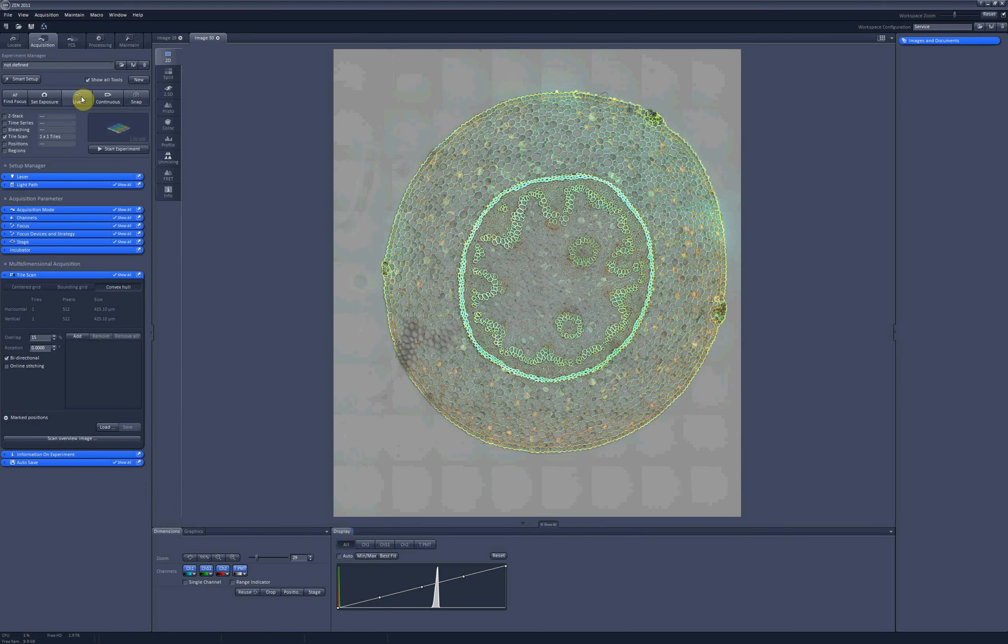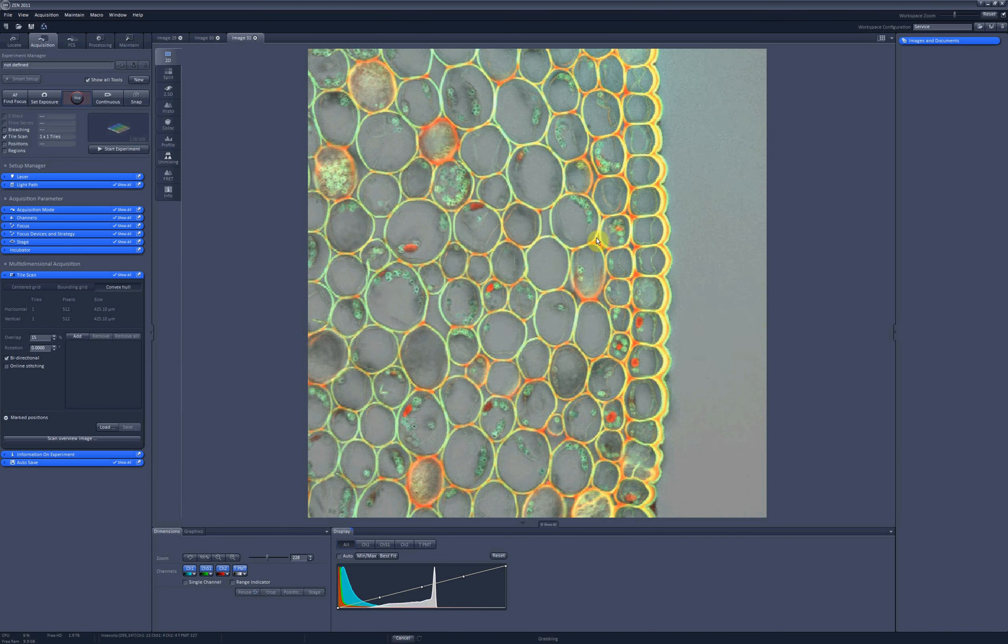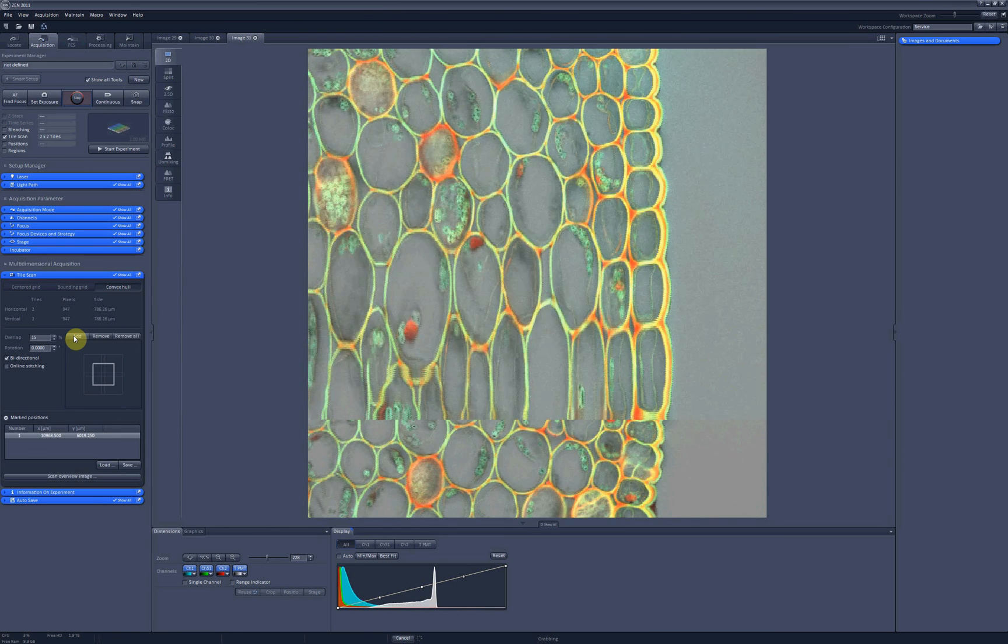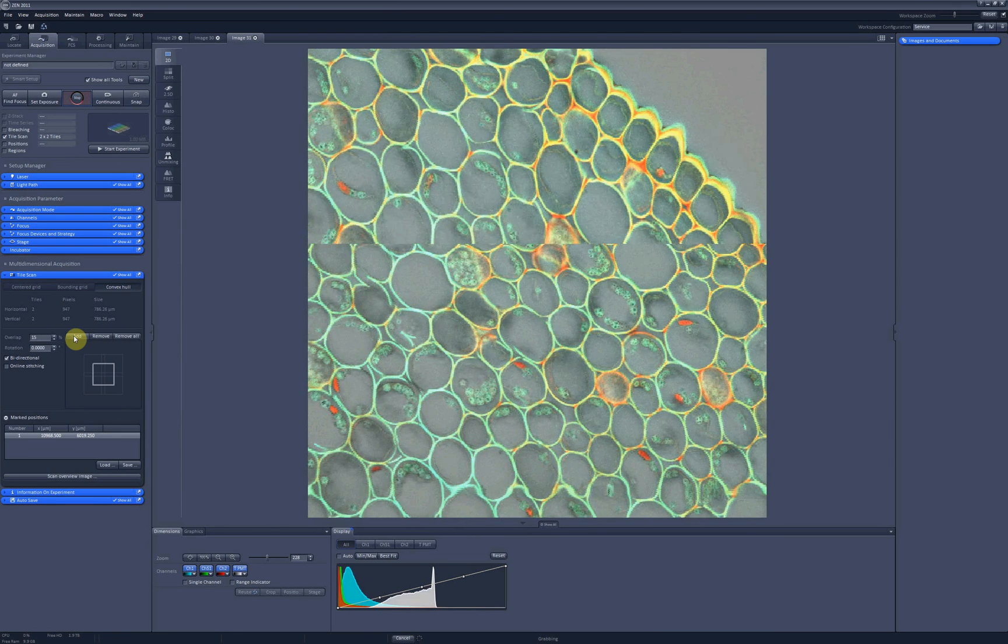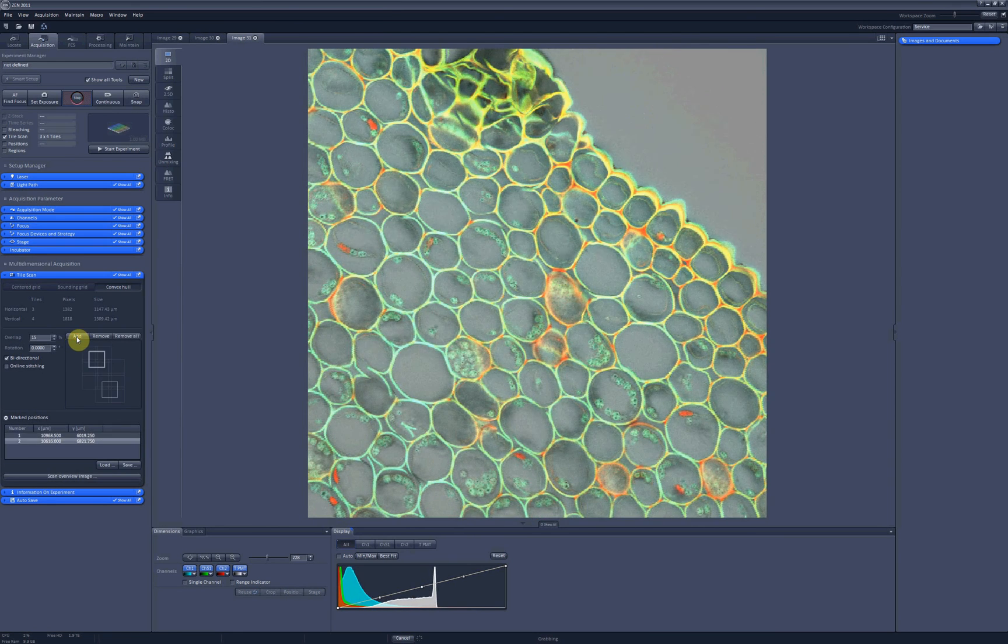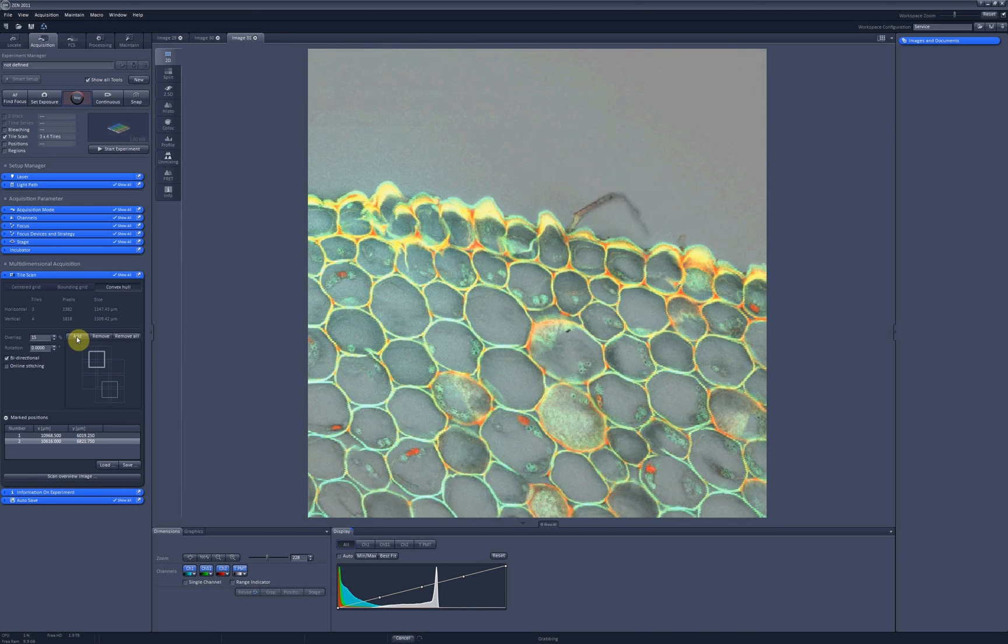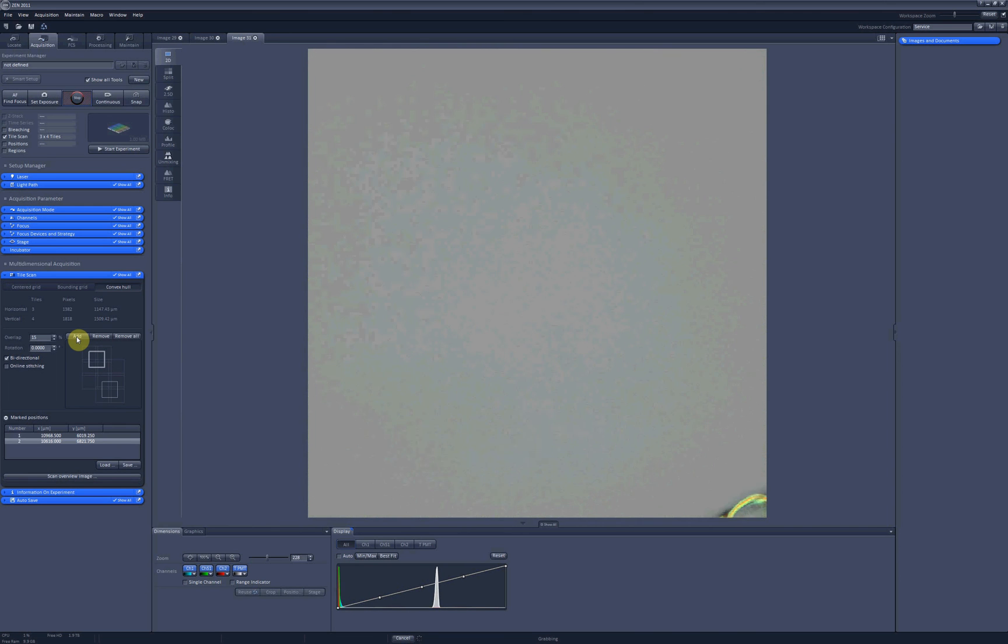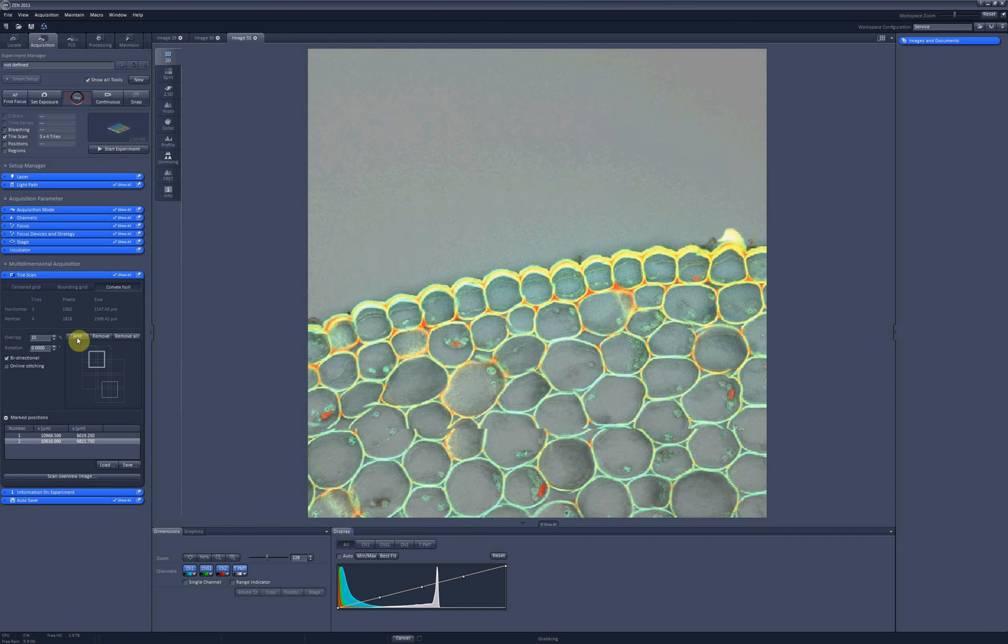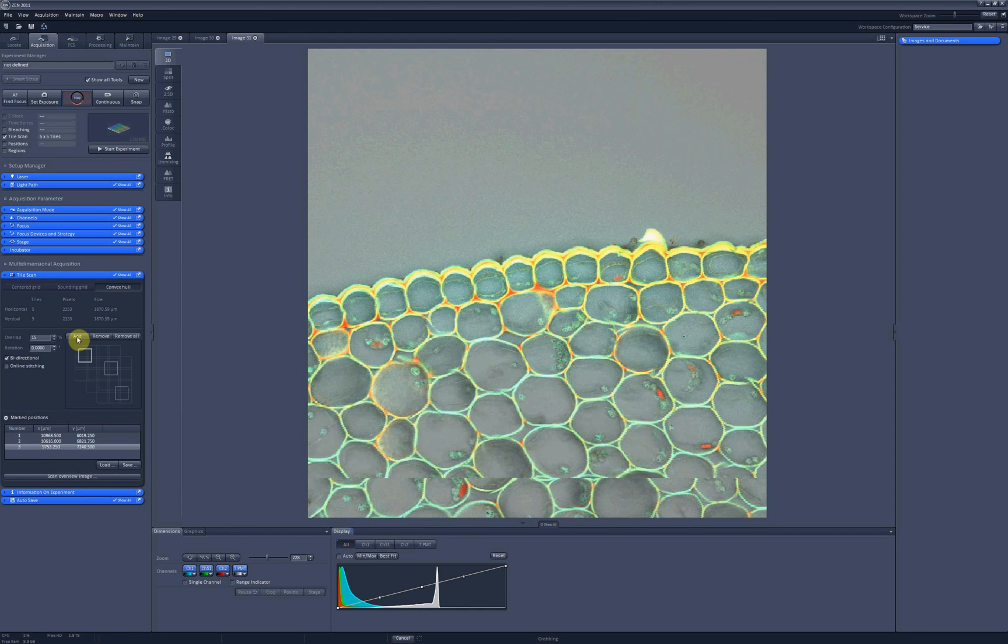So I can go back to the live scan and add this position, and then somewhere close to the top. And then the very top.